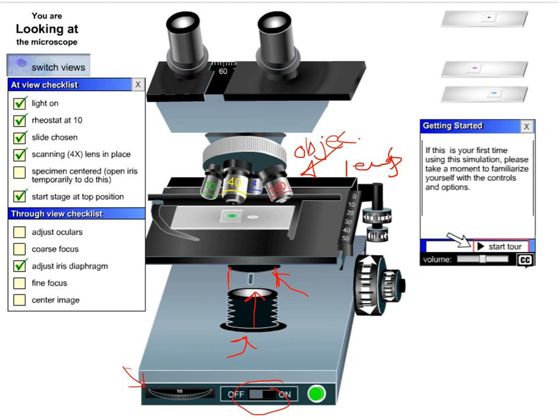Another thing to set up is the diopter adjustment — these two pieces need to be adjusted so that both eyes are seeing in the same focus. You click on the button to do that. Don't worry about memorizing all my directions; you can absolutely figure this out by trial and error. I myself figured it out by trial and error — I found this online and decided it's a useful experience for you. One of the things you need to submit is the at-view checklist.